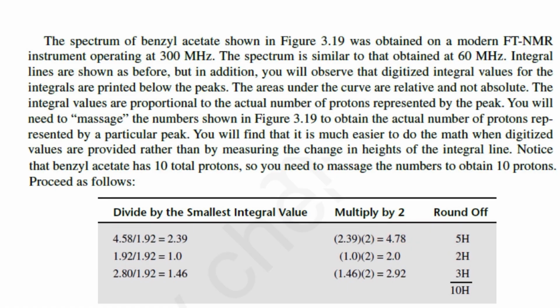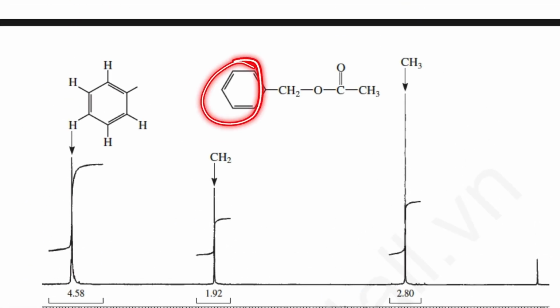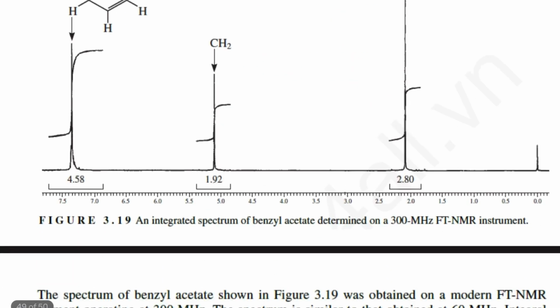This will remain as 2, and similarly this will be converted into 3 protons. So after rounding off, we get the data of 10 protons.